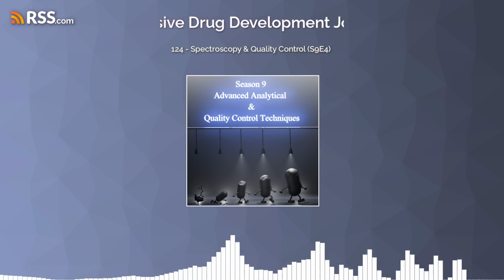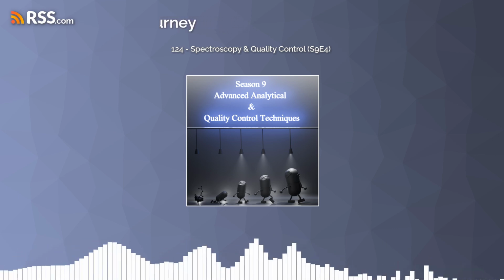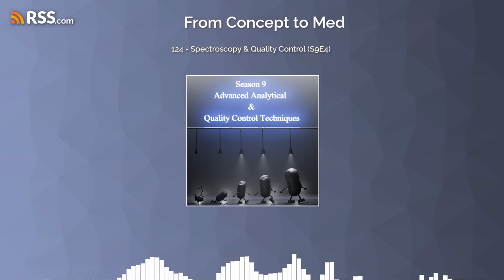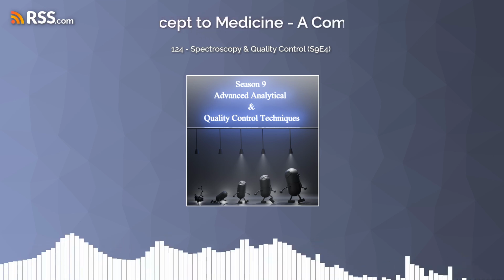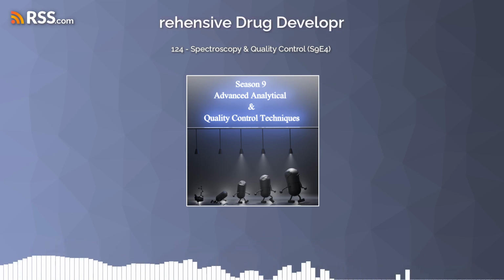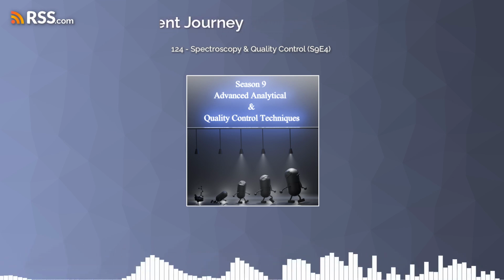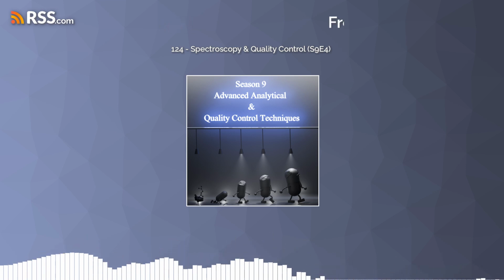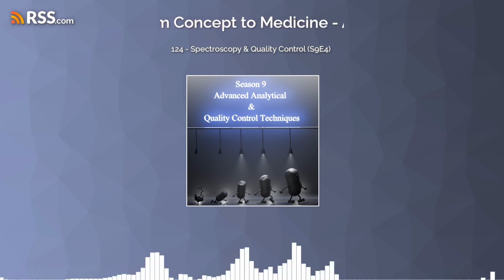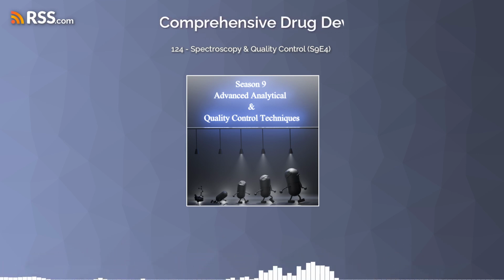Okay, what about NMR? So NMR is often used to deal with impurities. Let's say in drug development, they're making a new drug and they detect an impurity and they want to figure out what it is. So they use NMR to analyze the structure, and they're able to figure out where this impurity came from in the synthesis. And they can modify the process to prevent it from forming. Got it. So that's a really important application of NMR. So it's not just identifying the impurity. Right, it's using that information to change the process, to improve the process, to make a better product.